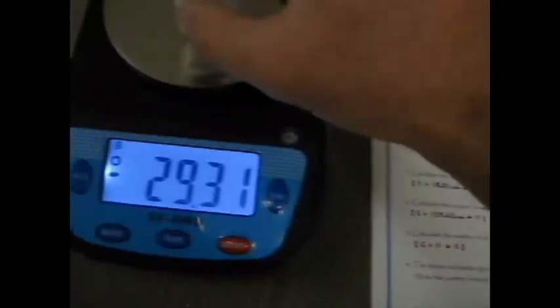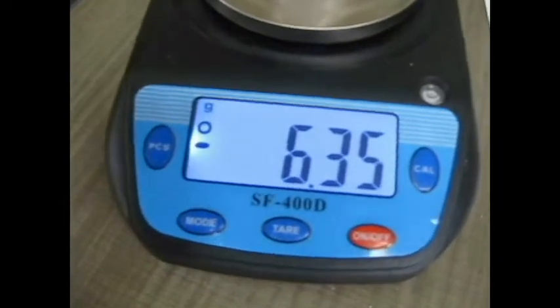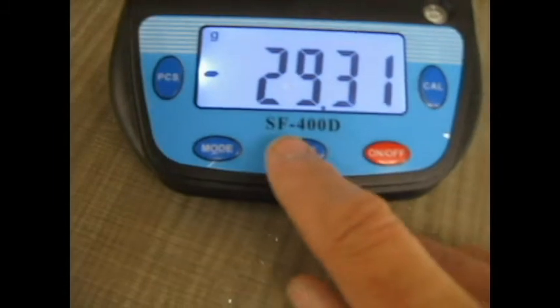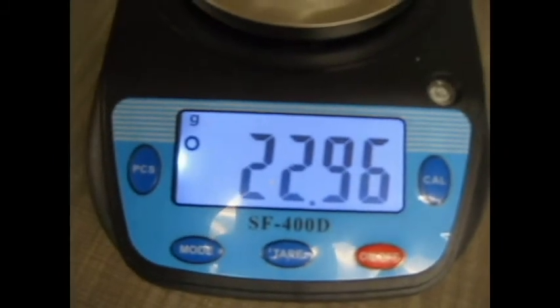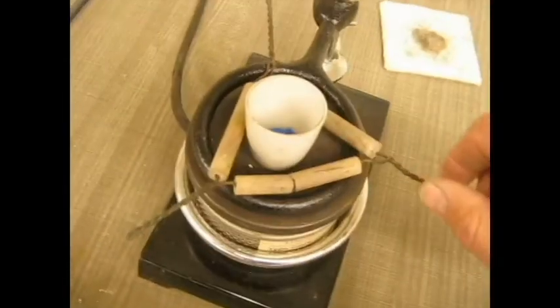Now I want to pour that into my crucible and get the total mass, or I could have added those two to get it. This is the total mass. The reason I want to know this is because... oops, notice how I didn't tare it? I better tare it with nothing on it. Get the total mass like this. So 22.96 is the total. I could have added them, but there's less rounding if you measure it directly. That goes in B.